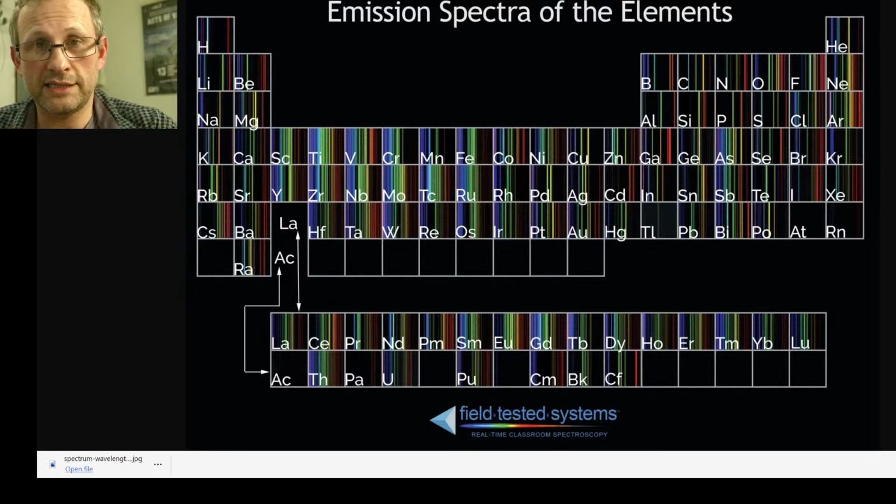And I know the Sapphire team have used this technique to assess the potential synthesis of elements in their experiment live. I would imagine that their device is a lot better than this device, but you can often achieve 95% of the answer with something that's a lot more affordable. And sometimes you can actually do better with something that's appropriate for the reactor that you're working with.